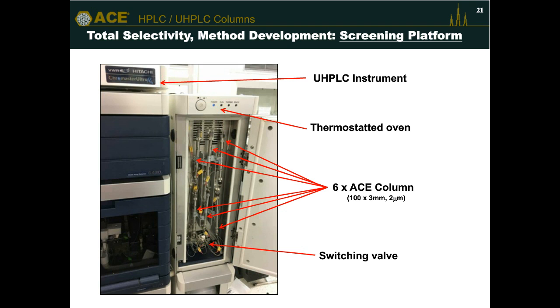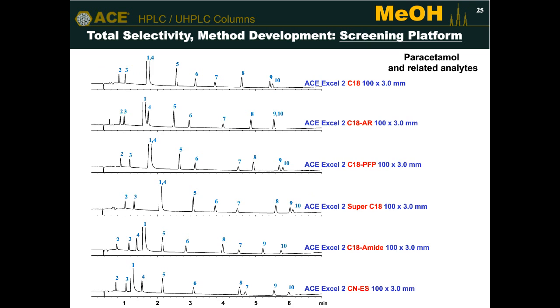Someone asks some questions about some of the examples you presented. How do you do peak tracking for the 10 compounds during screening runs? In this particular example, as I mentioned earlier, we were asked to develop this related substances method, but we knew what all 10 compounds were. So this is, in many ways, an easier example because we had all of these species available to us individually. Therefore, we could run the individual components to make sure we identified the peaks properly. So that answers the question directly.